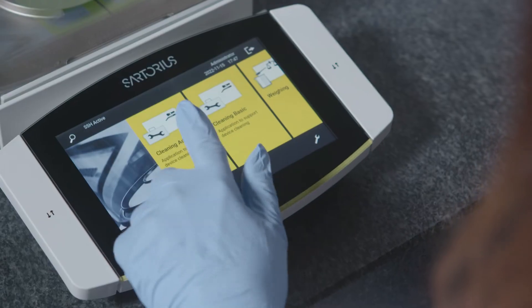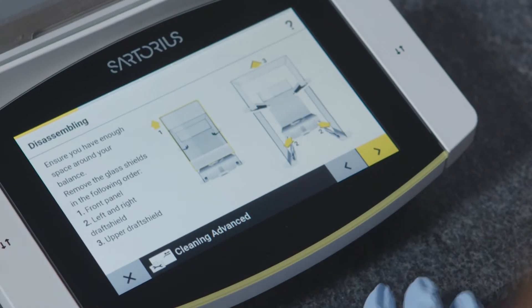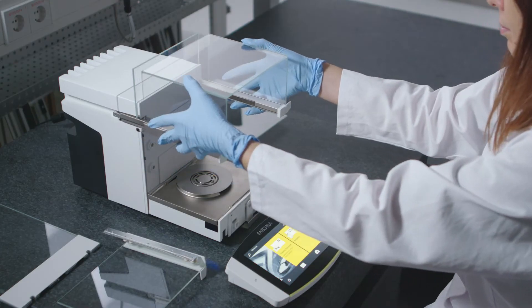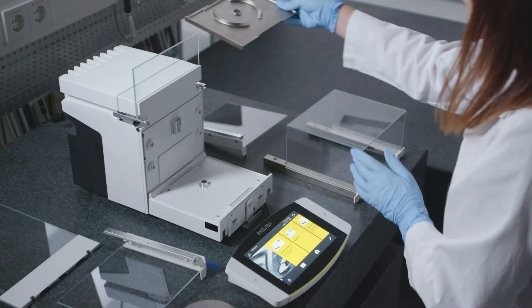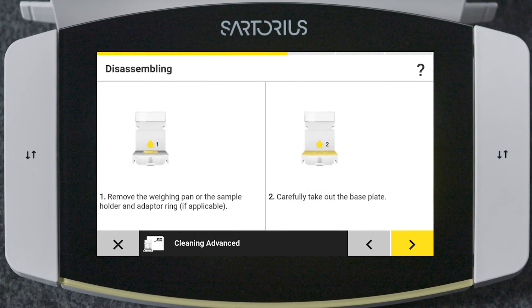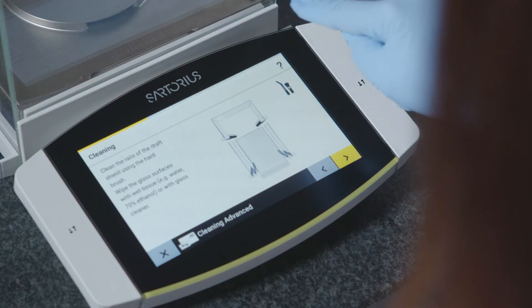Every three months, we recommend doing a more thorough cleaning of the instrument by removing the display, glass shield, weighing pans, and the base plate. This is so easy on our new balances. The cleaning app guides you through the whole process with visuals to help at each step. If you get stuck along the way, just click the help function. It doesn't get easier than this.